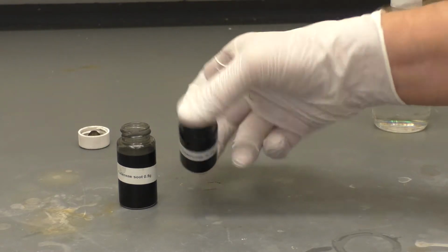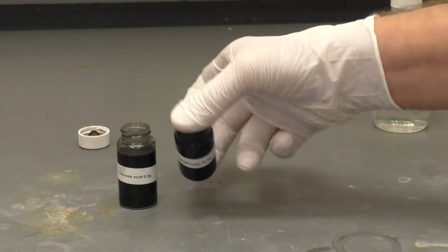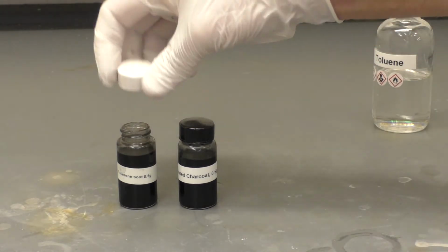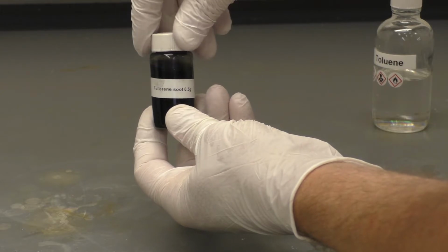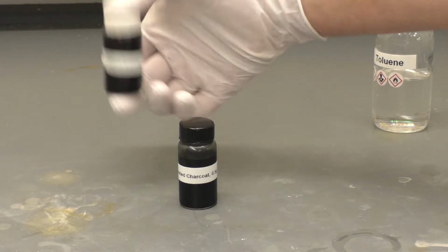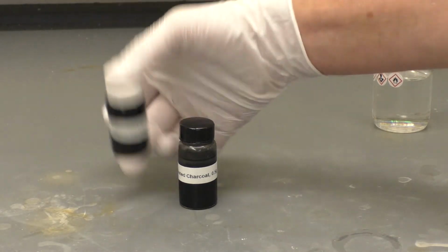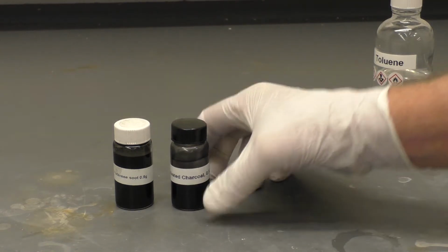So what a solvent is, is just any sort of liquid or gas. It could be any phase that has an attraction for whatever is going to be dissolved into it. So this toluene solvent has an attraction for the fullerenes, C60 and C70. And so the fullerenes will selectively be dissolved in the solvent, hopefully, after this is done. But all the other random weird carbon-carbon bonding stuff that's going on in the soot or the charcoal will be left behind.